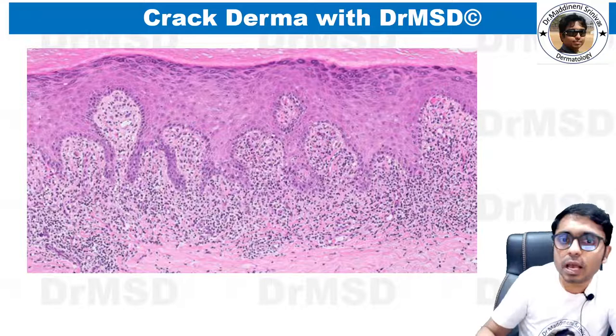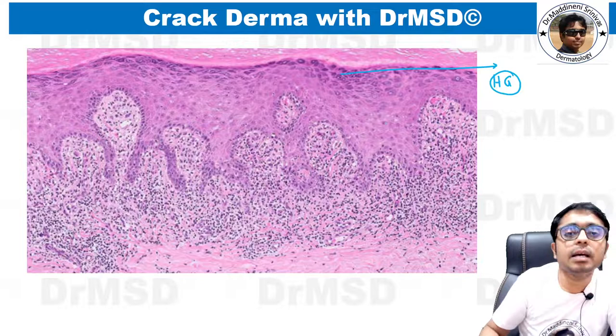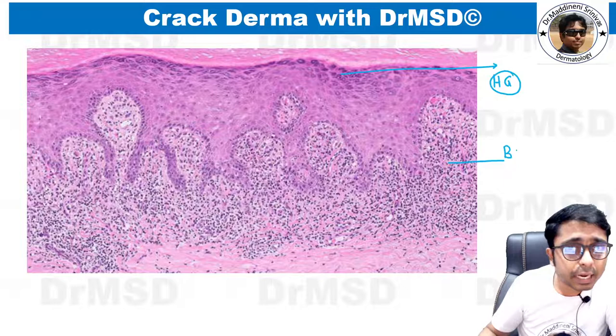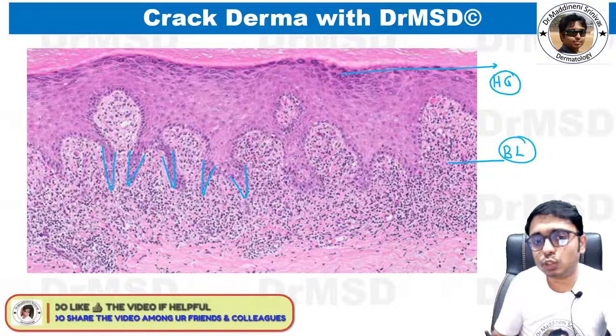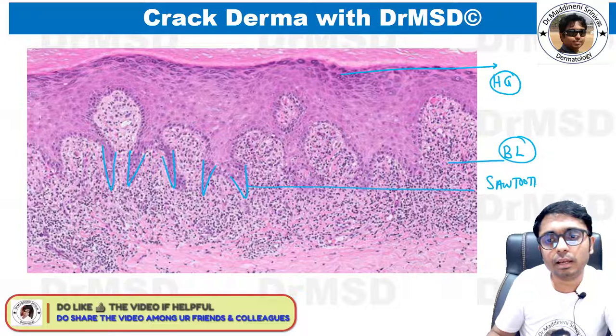Here you can see the actual histopathological picture of lichen planus. You can clearly notice hypergranulosis, and also see very confluent band-shaped lymphocytic infiltration. If you observe carefully, you can also see that the rete ridges are becoming very sharp — this is the reason they are called saw-toothing of the rete ridges.